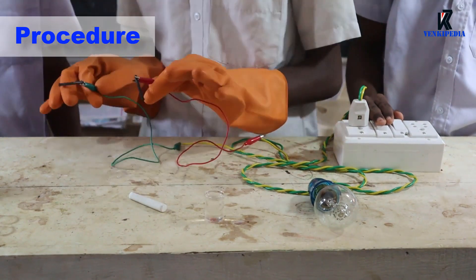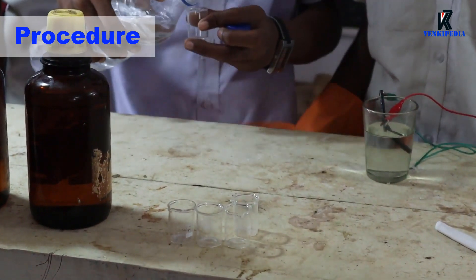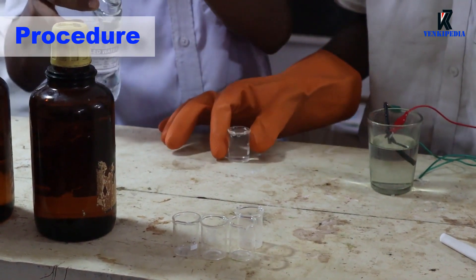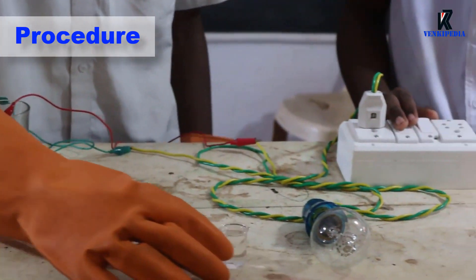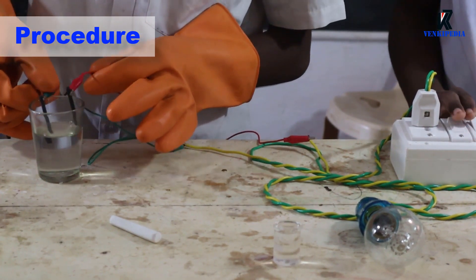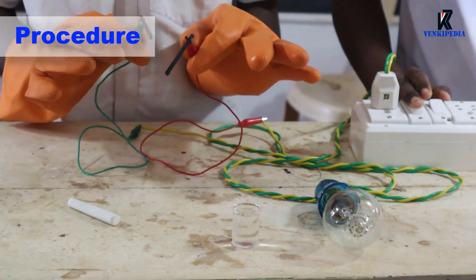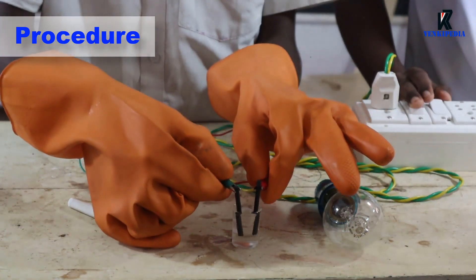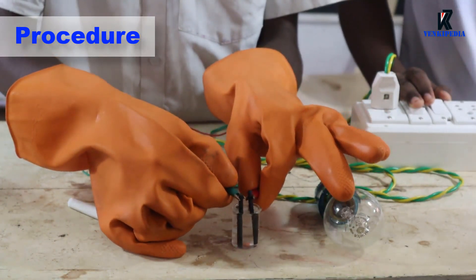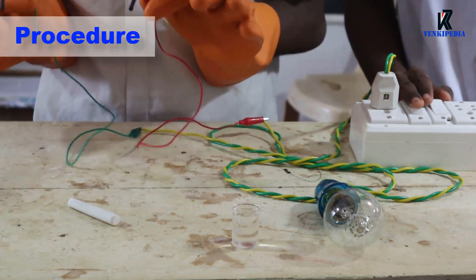Ethyl alcohol cannot conduct electricity through it. Take distilled water in another beaker. Wash the graphite rods again with distilled water. Now test the conductivity of distilled water. We can see that the bulb is not glowing. This indicates that distilled water cannot pass electricity through it.